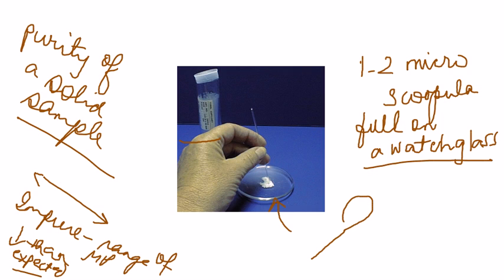Here is your spatula. You can use the back side of the spoon and use your index finger on top of it to press gently to make sure that there are no big lumps or crystals still present. We have taken the time to powder this, but this is just to make sure that it is as powdered as possible.